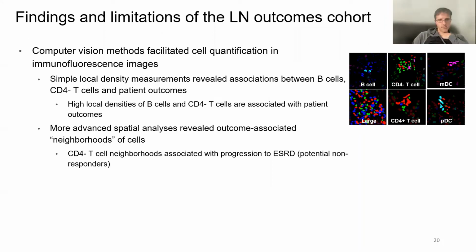Thank you. Thanks. All right, Rachel. Hi, I'm interested in some of the trouble that you had with the CD11C positive cells. When segmenting myeloid cells, a lot of times because of their morphology, they don't necessarily have a nucleus that's in the same plane, or that nucleus might not be in the center of the cell. Are part of the problems that you had related to the localization of the nucleus, and are there ways to get around that issue in the segmentation?